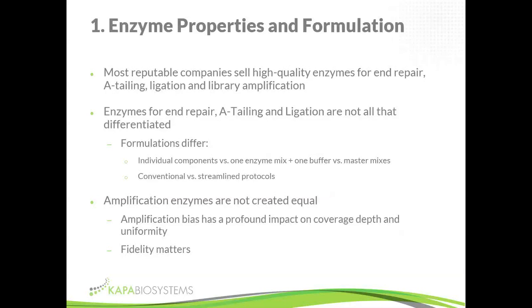This is obviously more convenient, but beware that master mixes are less stable than individual formulations. Whenever you select a kit, convenience is a great thing, but look at the shelf life and select the kit that will give you the longest shelf life. In other words, you want the best chance that when you use the kit today and six months later, you're going to get the same performance out of it.